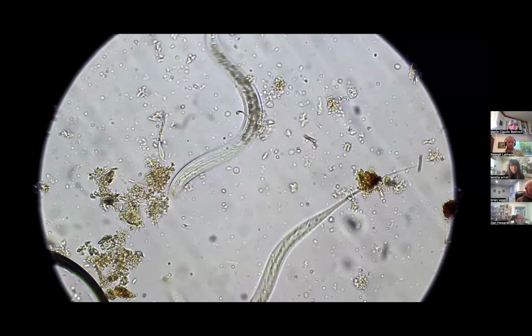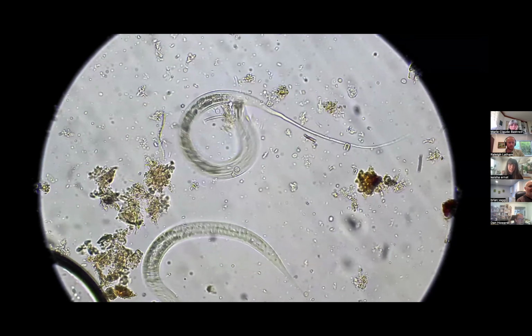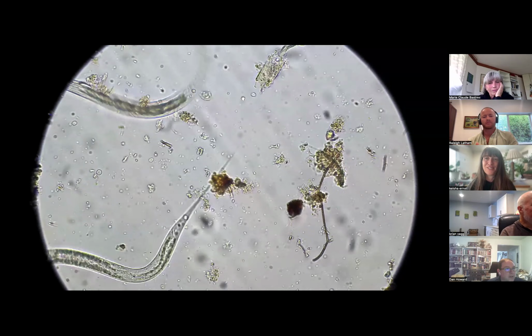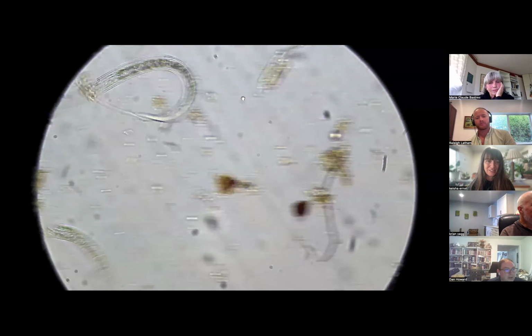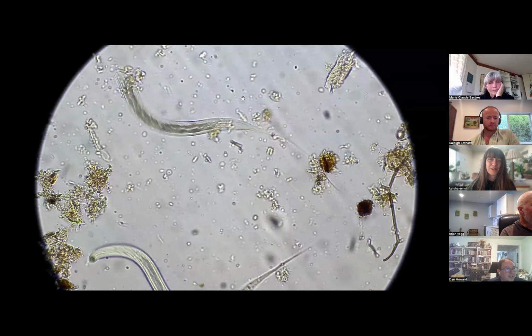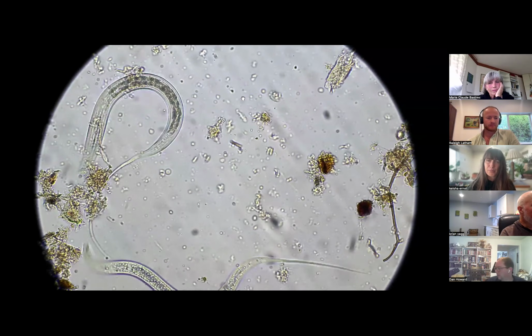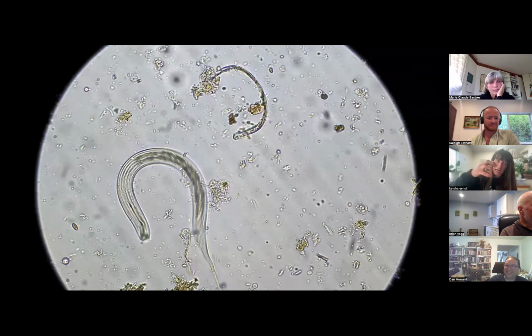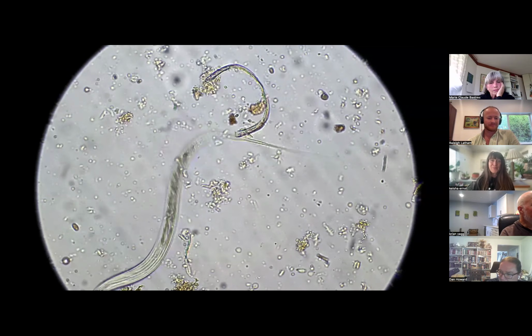Oh, maybe we'll get lucky and it'll eat this nematode right here. Whoa, two of them. I have video of a nematode attacking and eating another nematode. Casey and I in real life, you can't hear it on the video, but we were going, is that a predator? Is that a predatory nematode? Oh my gosh, is that a predator? And then it grabbed the other nematode and we were like, oh, it is a predator.